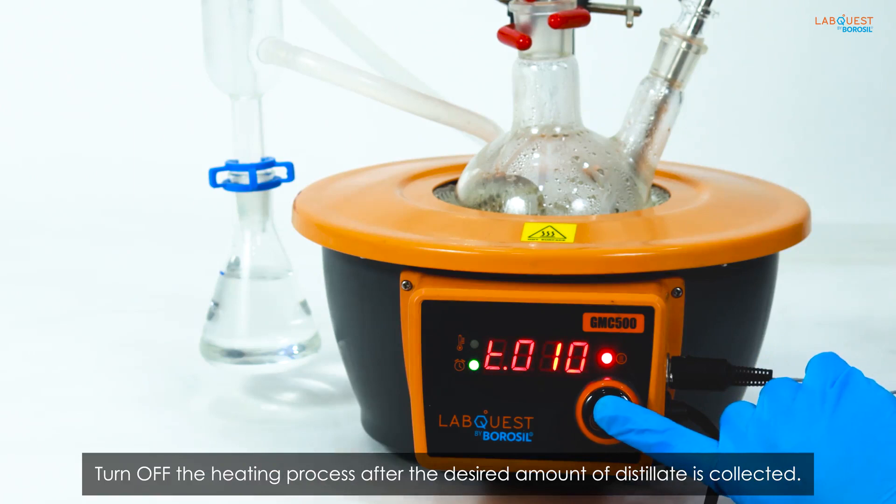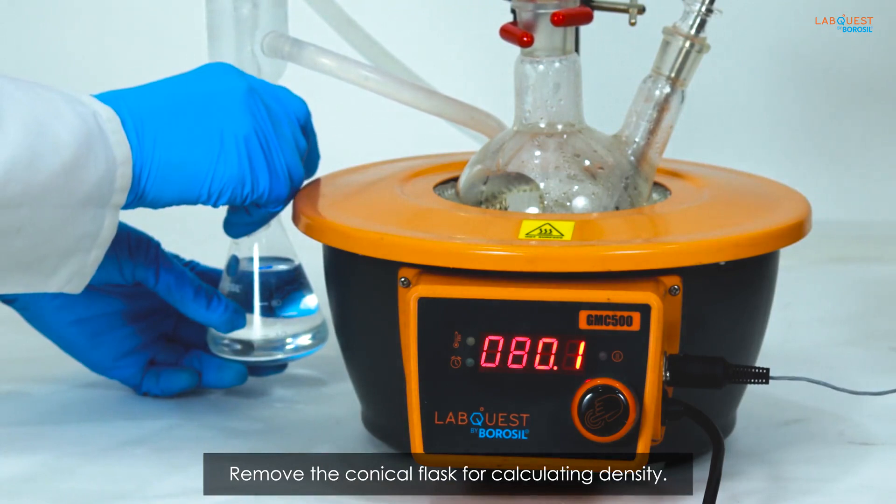Turn off the heating process after the desired amount of distillate is collected. Remove the conical flask for calculating density.